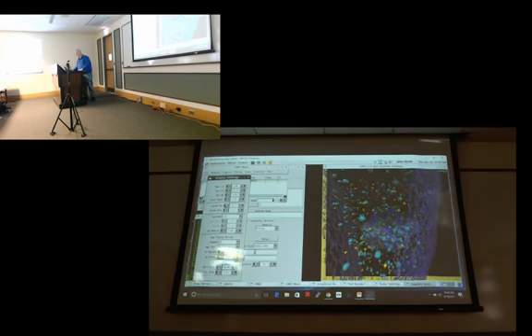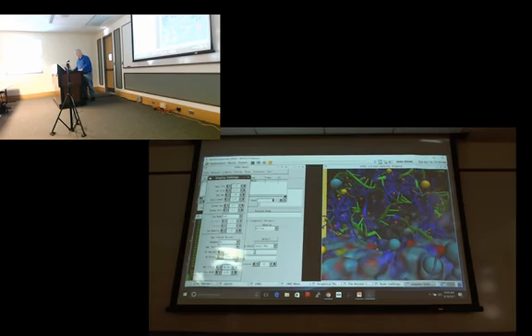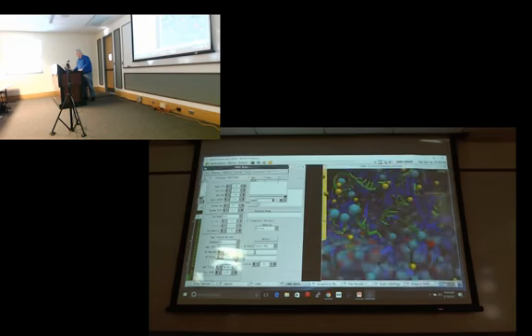Not even the widest field of view head-mounted display can pull that off. So something like this, where the height and distance are the same, is basically a 90-degree field of view. That's like what you have with your normal eyesight at a normal viewing distance like this. So that's not the default, but if you make those two numbers the same, 2 and minus 2, magnitude-wise, are the same, then it looks like what you see with your natural eyesight. So that's a very convenient thing.